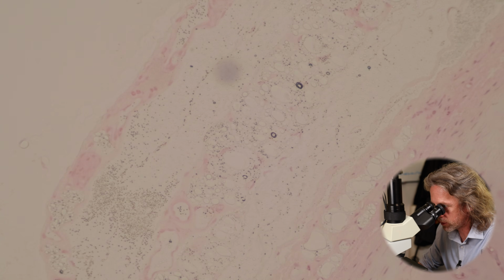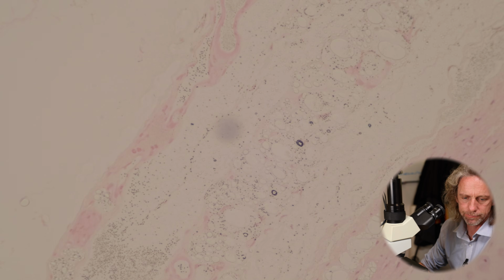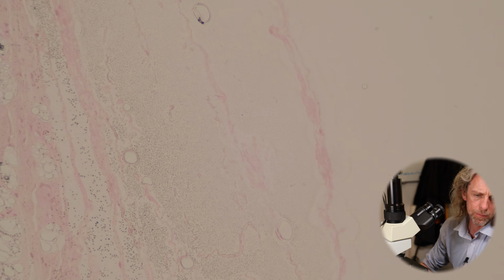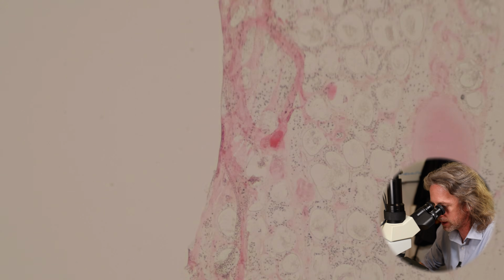So if we go outside the ring again, away from the lumen, the tissue outside the cartilage is the adventitia layer, which isn't staining particularly brilliantly on this section. This is the connective tissue and the support tissues. We've got blood vessels and nerves and so on in there. So the adventitia is around the outside of the trachea, but like I say, it's pretty weakly staining here. All right, that's it for the trachea.